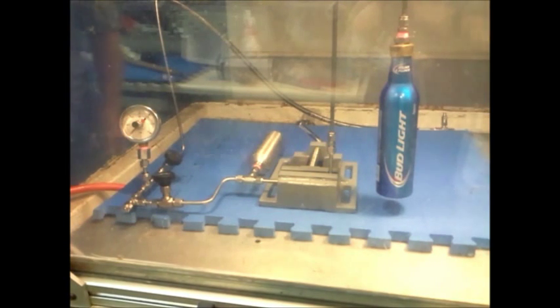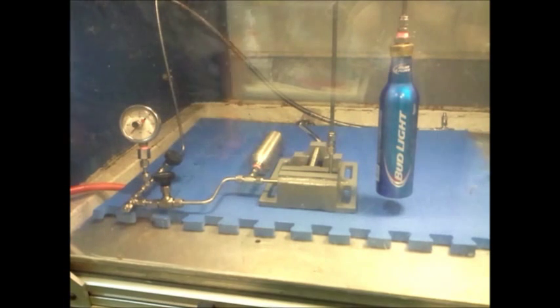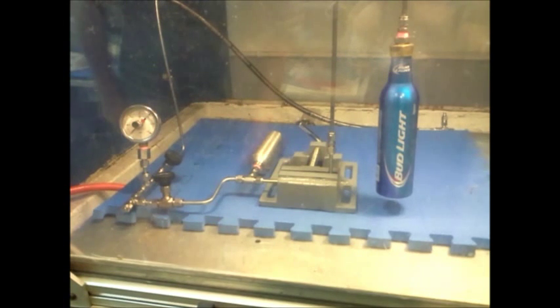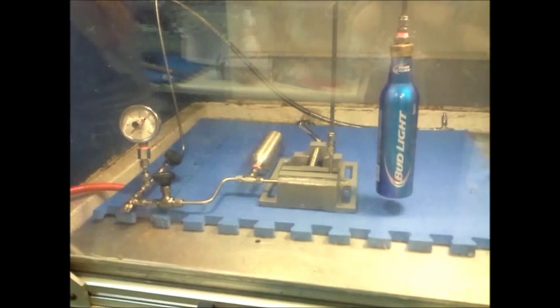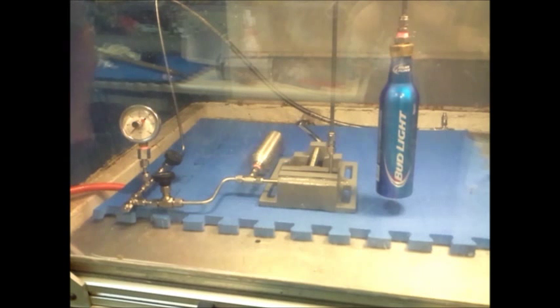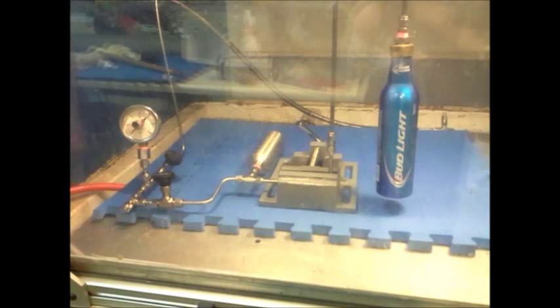We have set up a standard burst test using a system filled with water and pressurized with compressed air. We will pressurize the system slowly until the can bursts.